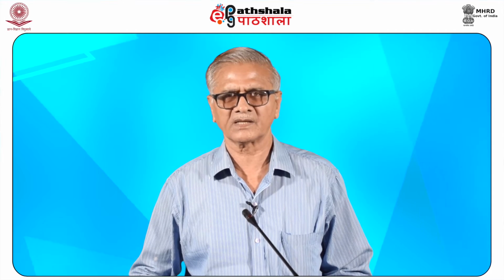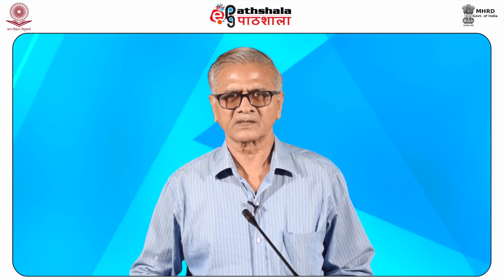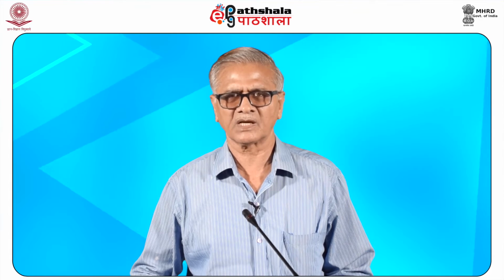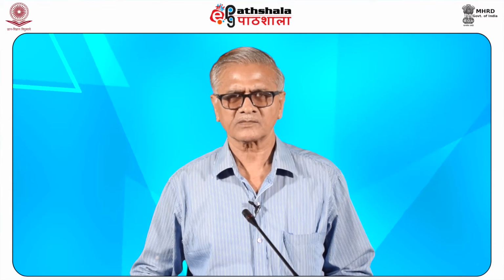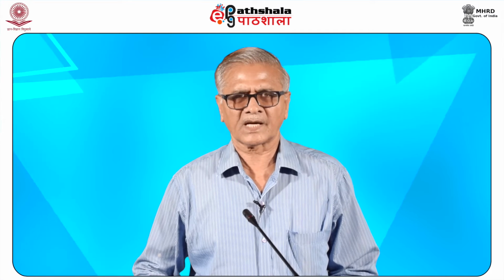The dark band in a lane indicates a DNA fragment that is the result of chain termination after incorporation of a dideoxynucleotide. The relative position of the different bands among the 4 lanes is then used to read the DNA sequence from bottom to top. The technical variation of chain termination sequencing includes tagging each dideoxynucleotide with fluorescent dye.